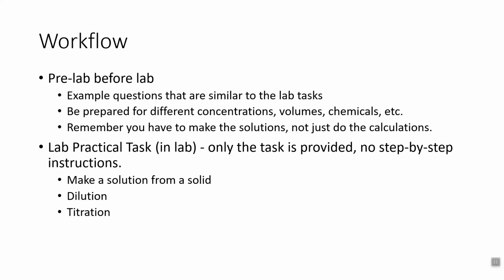Come to homework help or office hours, all listed on Brightspace, and we're happy to talk you through it as you're doing it. So the lab practical is 2 tasks really, and only the tasks are provided. There's no step-by-step instructions for the task, so it's not going to tell you step-by-step how to do it. You have to do the calculation and then figure out how to do it step by step. The example calculations in the pre-lab can help you with that. However, it's also important that you think about how to actually do it.